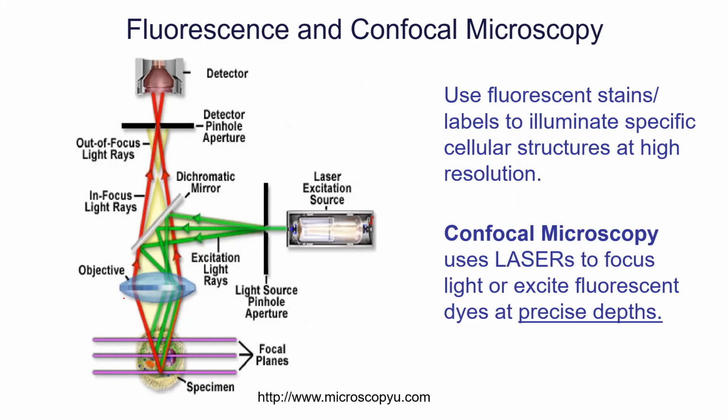Fluorescence is just using a fluorescent stain. And you probably know a little bit about fluorescence, is that fluorescent things glow. So now, rather than just having a specimen that's one color, another color, it's actually glowing. And you can get some amazing images, and you can get some really sharp details from this kind of thing. Other than that, it's kind of similar. There's different types of fluorescence microscopy. You can see this one here is using a laser, and the costs range from maybe $25,000 to $100,000 or $200,000, depending on what you're buying.